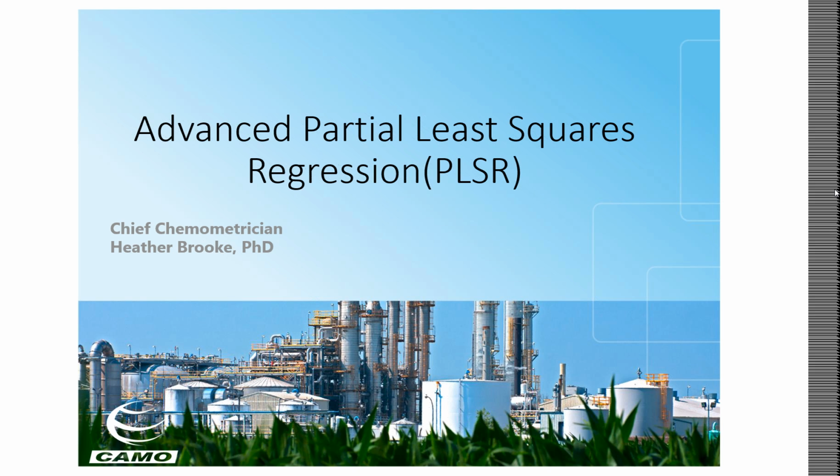Today we're going to talk a little bit more in depth about partial least squares regression and some of the techniques for using it and doing some pre-processing, which tends to be one of the big questions on how to handle your data. So feel free to ask any questions in the panel here during the seminar, and if I don't get to them right away, I'll definitely have a question and answer session at the end, so have those ready to go.